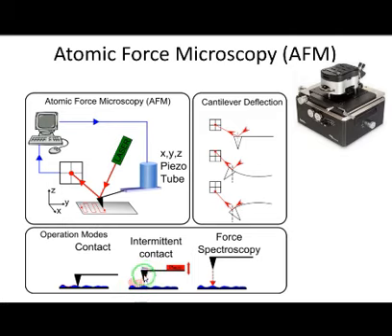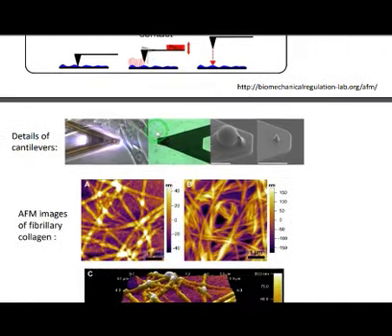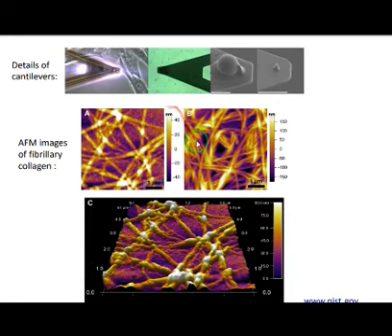The cantilever here is vibrating with a certain frequency, and when it feels the difference in the length here between the sample and the cantilever, this frequency of vibration will change, and with respect to that we can consider how the outer shell of our sample is changing. Here are some pictures that you can see. They have been taken by the AFM.